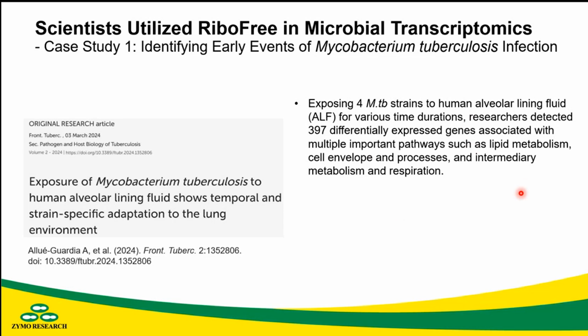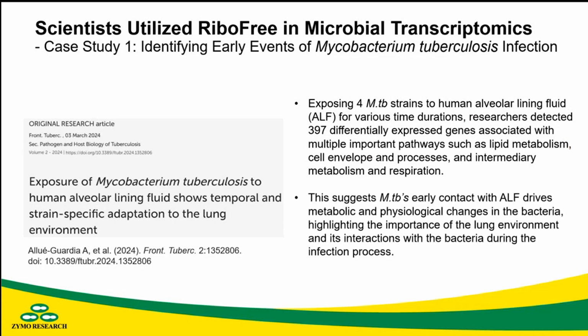This suggests that the TB's early contact with ALF drives metabolic and physiological changes in this bacteria. So this group of authors believe that this knowledge highlighted the importance of the host's lung environment and its interactions with the bacteria during the infection process. So this is again another example of how microbial transcriptomics of bacterial pathogens can add to humans' knowledge of how, in the future, we can better battle against these diseases.